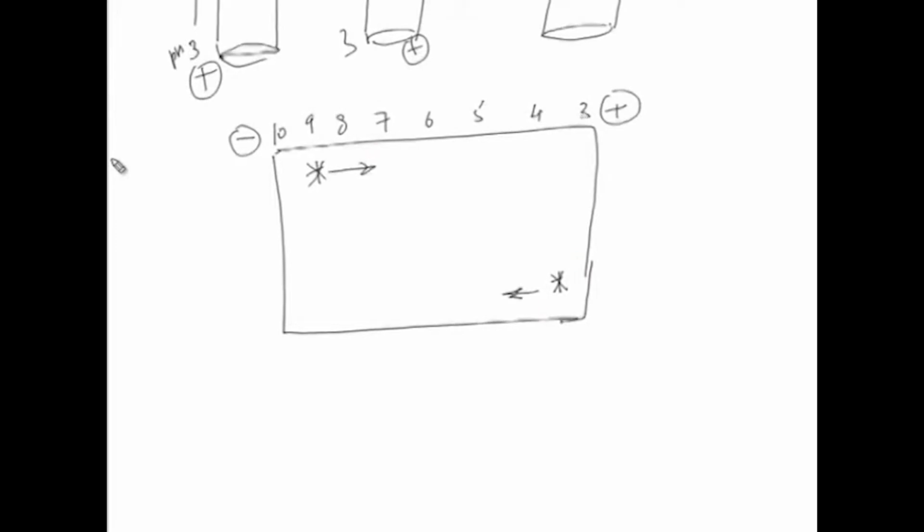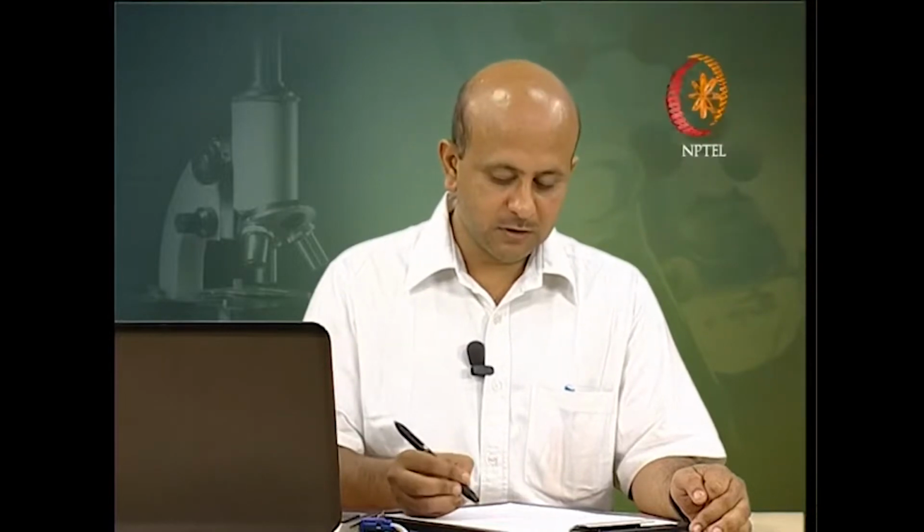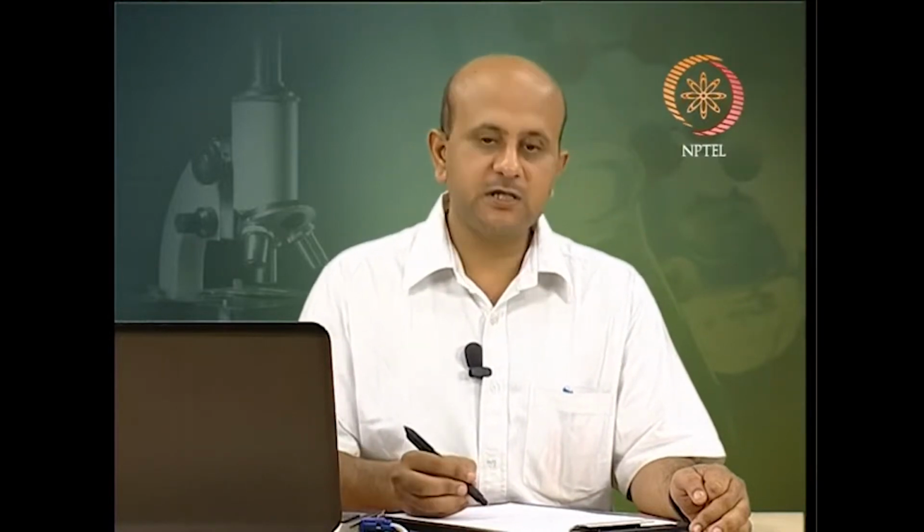Finally, they will settle down at pH 6, or they will focus at a particular pI value. So, this is how you can focus. You can see that because of the pH gradient due to ampholytes, the proteins loaded anywhere will come and focus at a particular place in isoelectric focusing. So, that is why the name is so.